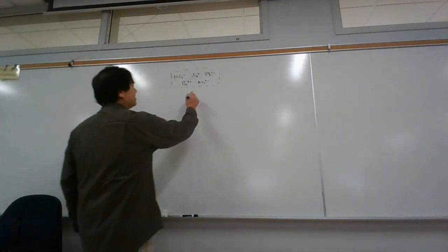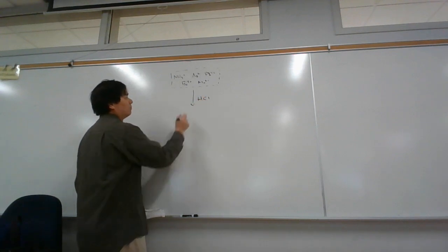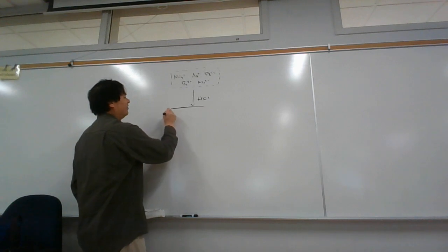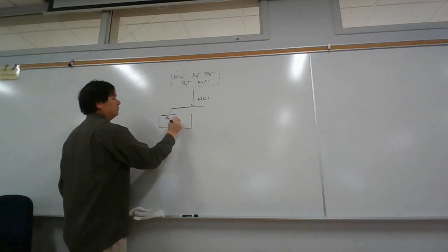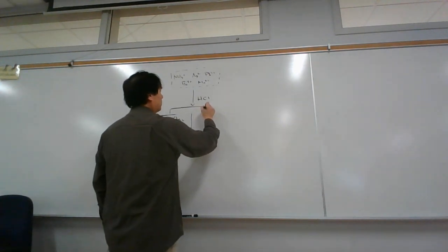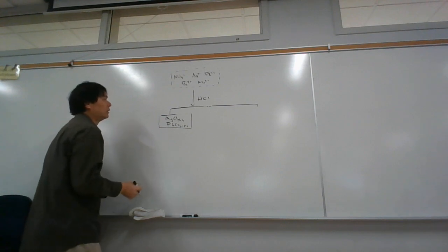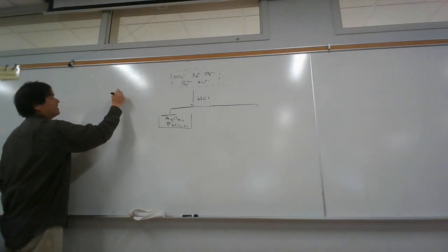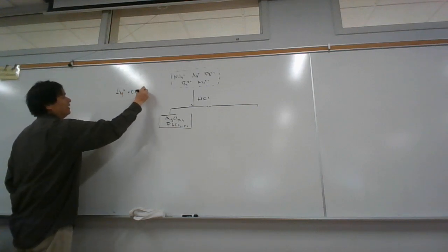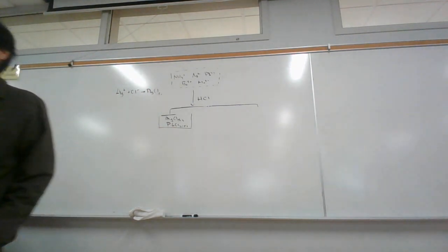So the first step in this is we're going to add our excess HCl solution. With the HCl solution, we're going to precipitate out both silver chloride solid and PbCl2 solid here. And so what's the reaction here? The reaction here is going to be silver ions, like chloride, to precipitate out silver chloride. This is like a double replacement reaction, except the spectators aren't shown.